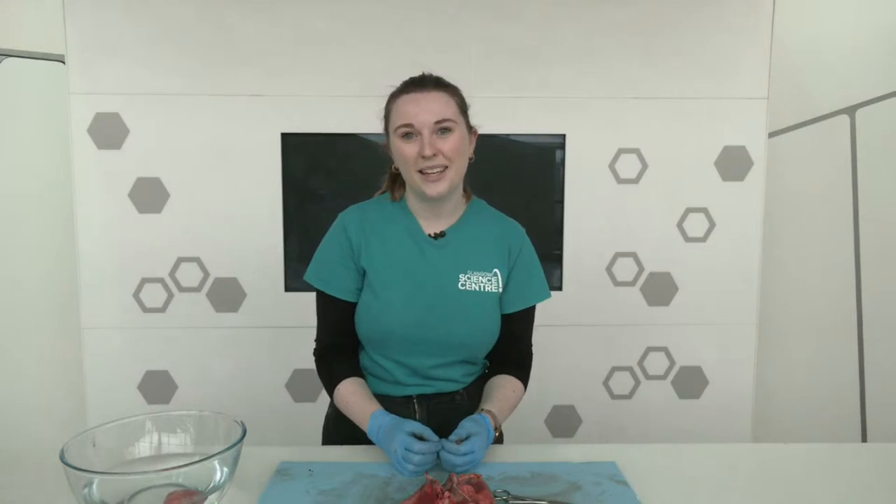That brings us to the end of our dissection. Well done, Harriet — that was beautifully done. Nothing like a dissection on a Friday morning to get us all going. Do you enjoy doing the dissections? The first time I was trained in doing dissections, we were all sitting in the lab together and had a big box — everyone had a set of lungs and a heart to practice on. The smell was overwhelming. But you do get used to it the more you go on. It's not for the faint of heart. There's definitely some people who are a bit more squeamish, but I like getting stuck into the blood and guts and everything.